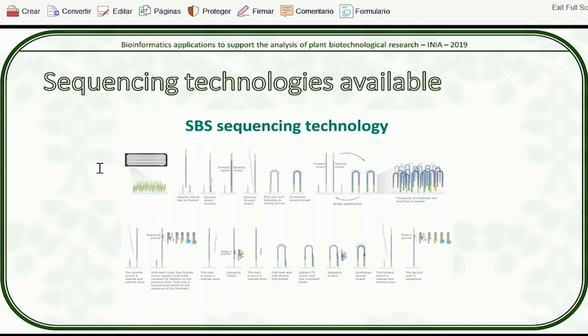After you choose the insert size, you start the library preparation, which basically means that you polish the fragments, you add some adapters, you add some priming sequences, and then you make sure that each of the sequences is attached to a bead. The beads go into a chip or a flow cell that goes into a machine. But before that, you do amplification, because the machine is going to start adding one base at a time in hundreds of thousands of beads that are very close to each other.